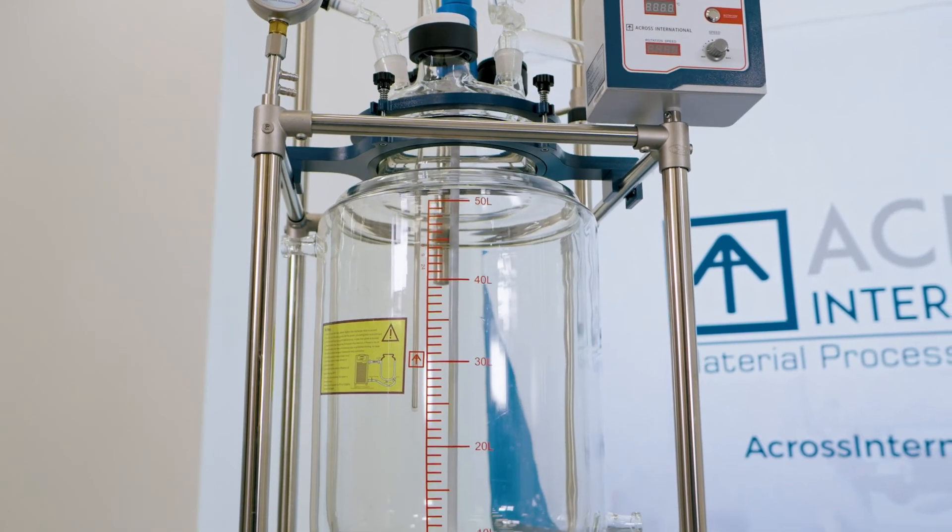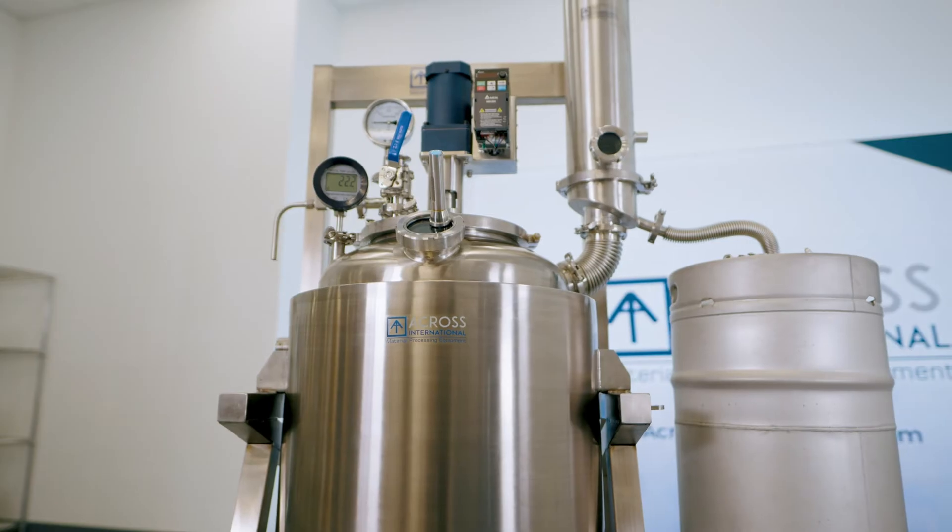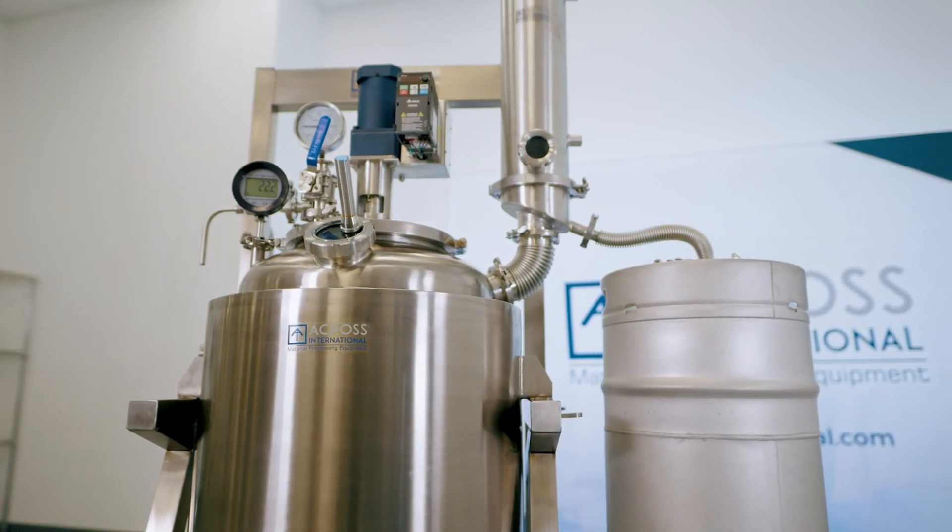As many of you may know, the chemical reactor is extremely versatile and can be utilized in numerous processes. It is for that reason that we offer 10 liter to 200 liter glass reactors and 100 to 300 liter stainless steel reactors, all ideal for cannabis extraction and processing.